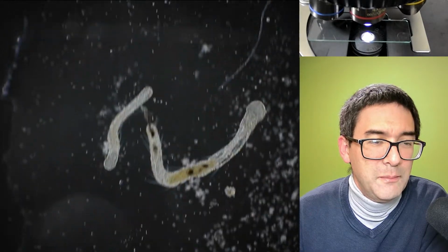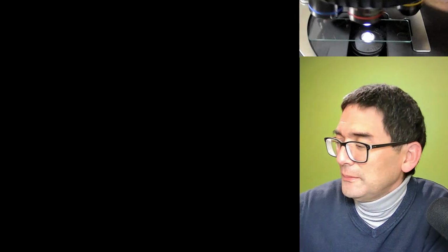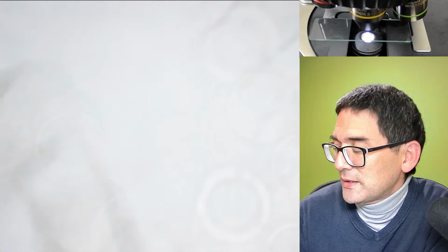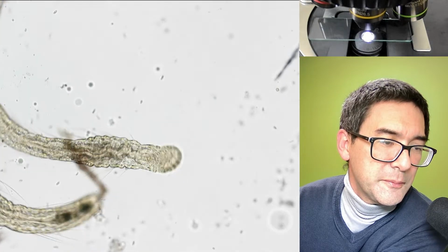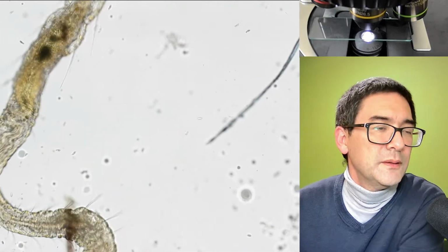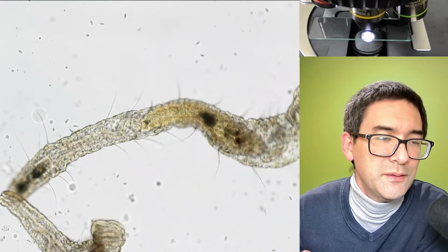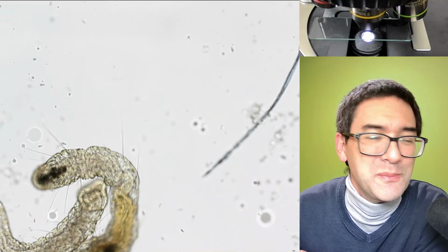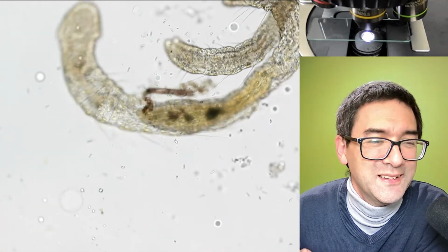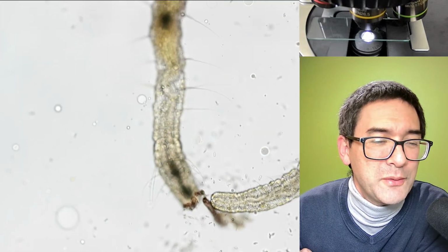So, if we go in, let's go up a little bit with the magnification. Let's put this away again. Let's refocus. What you're able to do also is follow the food as it passes through the digestive system as well. Also something that can be quite nicely seen, especially because the worms are so transparent.